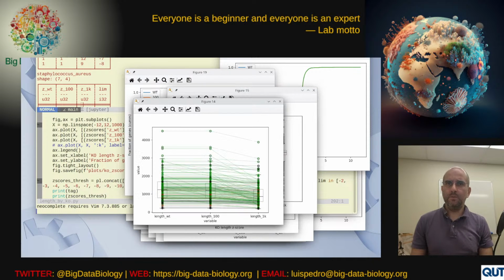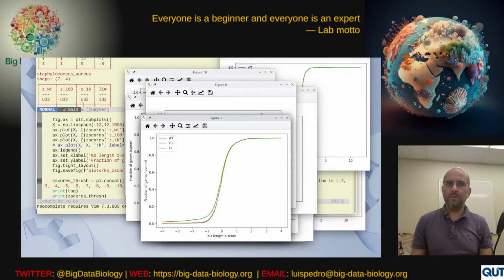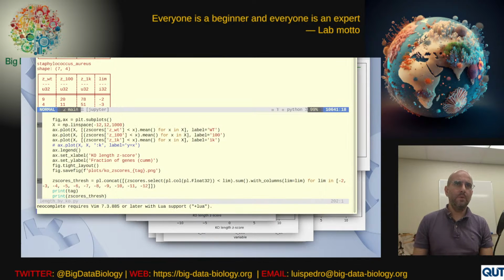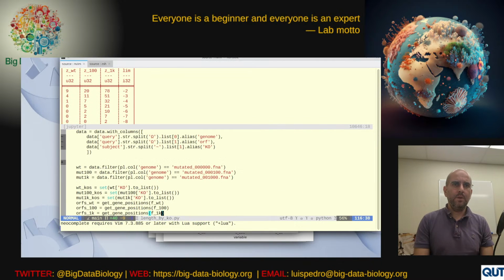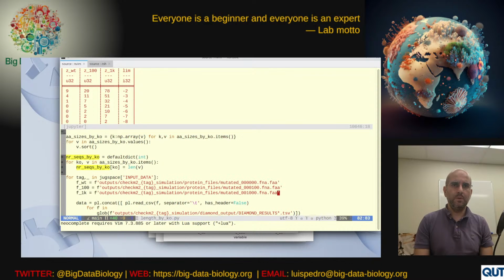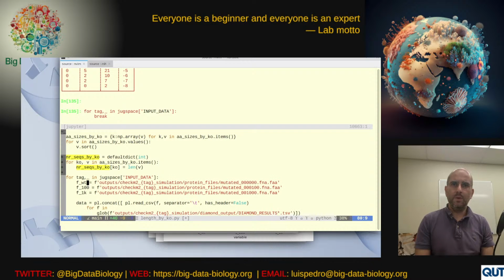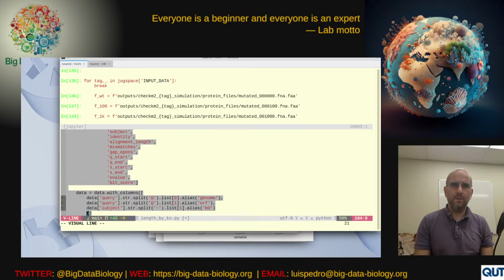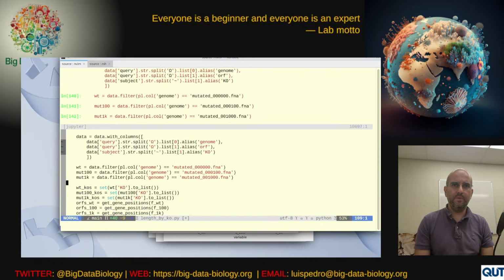Okay, right, we should do a little bit better job labeling these, but yeah, we still see this big enrichment there. Okay, let's go back to the E. coli example. So let's just add this line break there. Okay. Yeah. Loading the data using this new approach, this is nice. This is all much nicer.